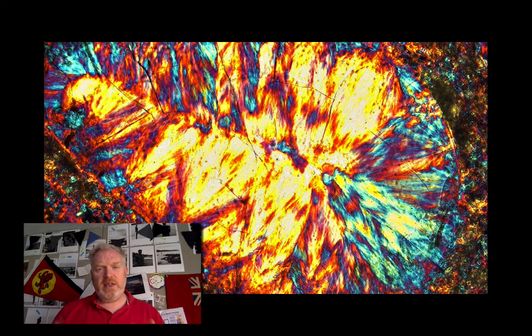Okay, these techniques are very high tech and very expensive. Something like £1 million for each one of these machines. And it's big research universities that have access to these machines. Cardiff University Geology Department, for example, has these. But even they hire out their machines to other universities that don't have them. They are an invaluable tool in analysing these tiny, tiny minerals that we can find within rocks.